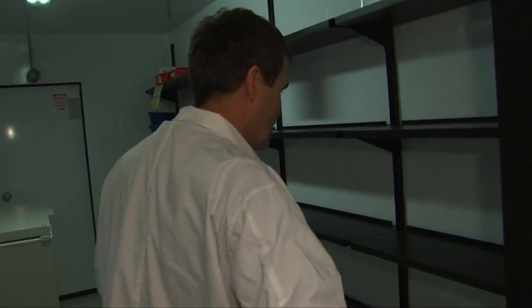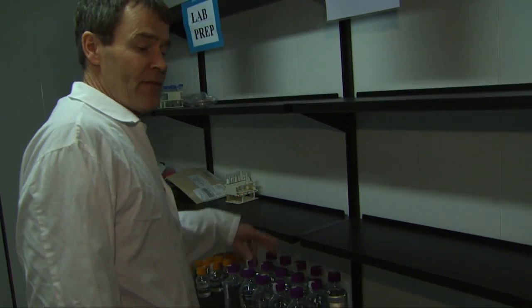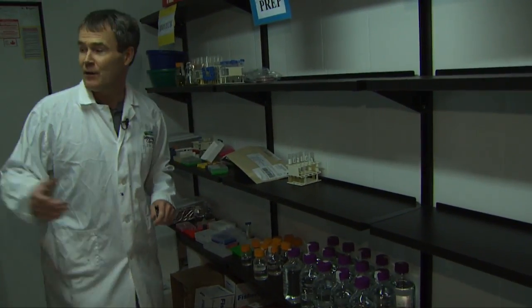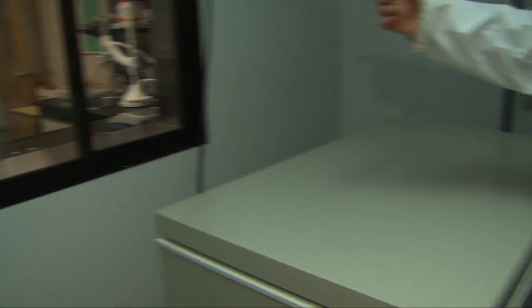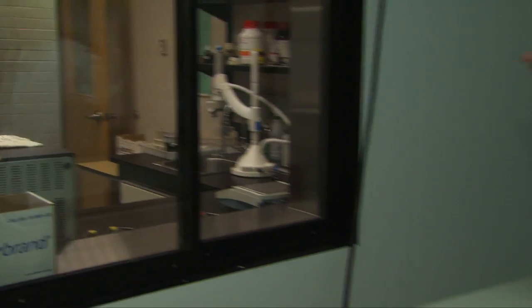This is actually our full walk-through incubator or fridge. This keeps all our material cold. We only use this for dirty material — we have another area where we keep the clean stuff. Everything's connected, as you can see. This is where we prepare our media, and the media will get passed through here and out into the next area.